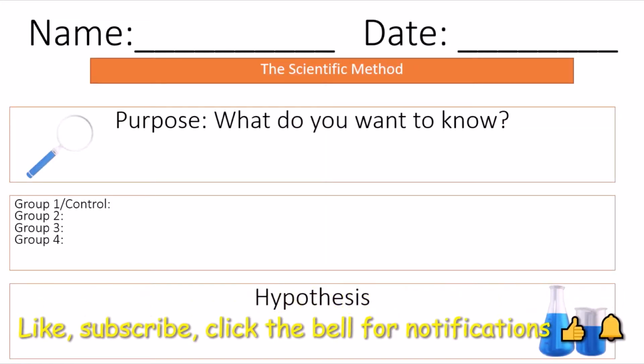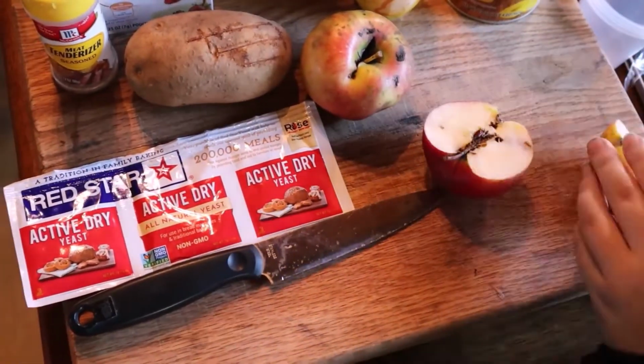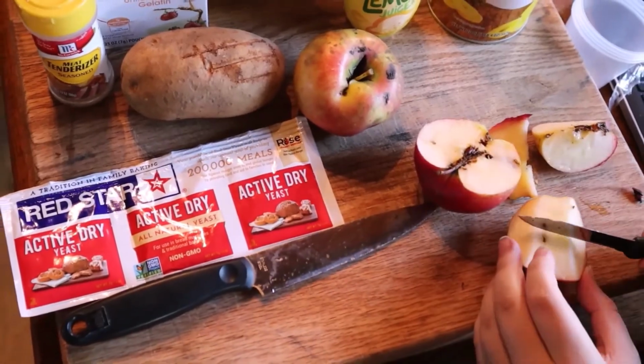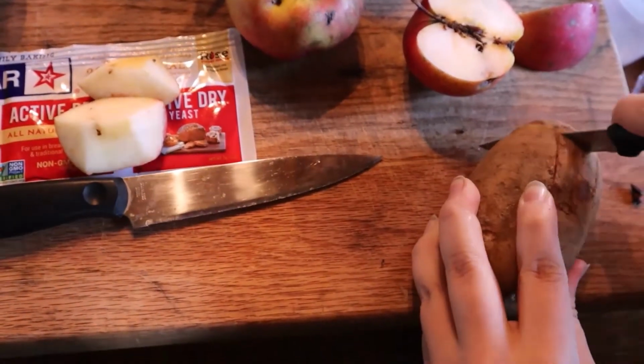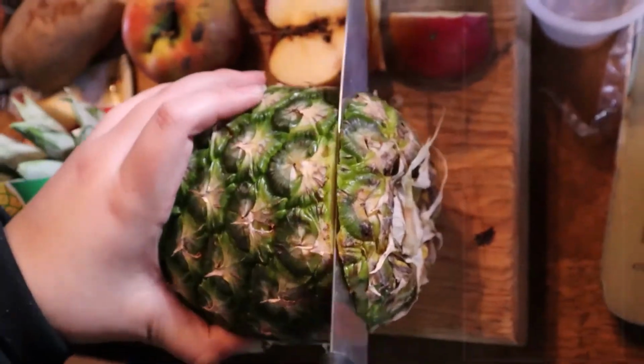A great way to start this off would be by having the students create a hypothesis stating which one of these food items they believe have the most catalase enzyme and also what they think will occur during the experiment. Then they can begin the hands-on portion. You cut your apple, potato, and pineapple into 1-inch pieces.